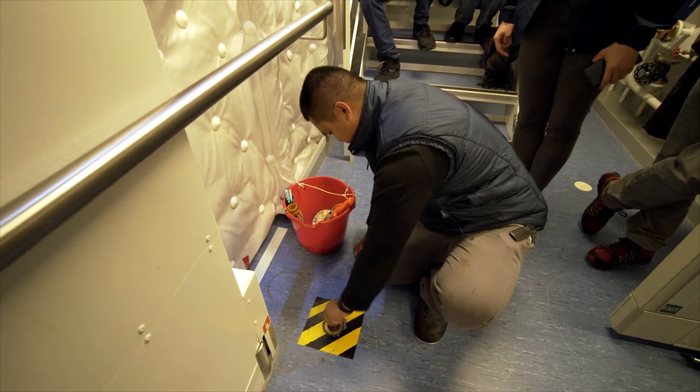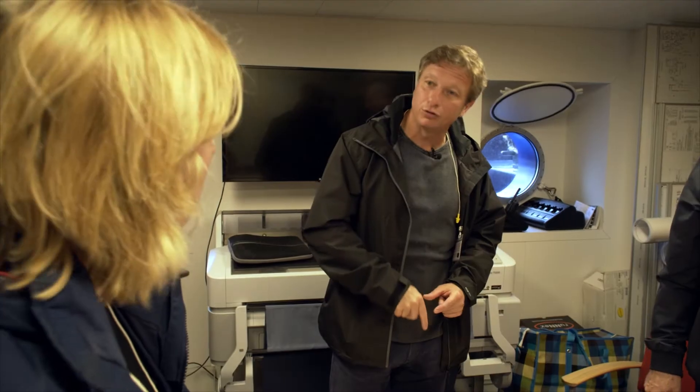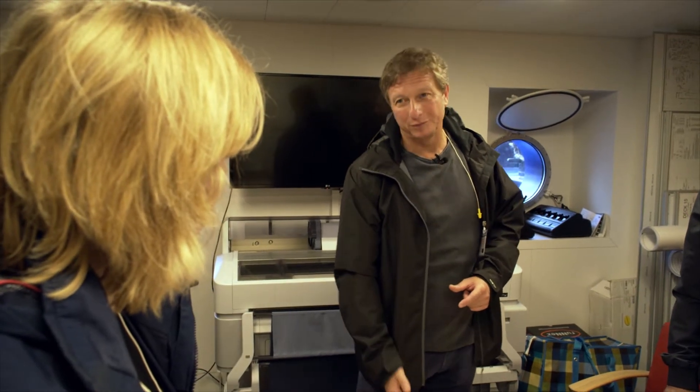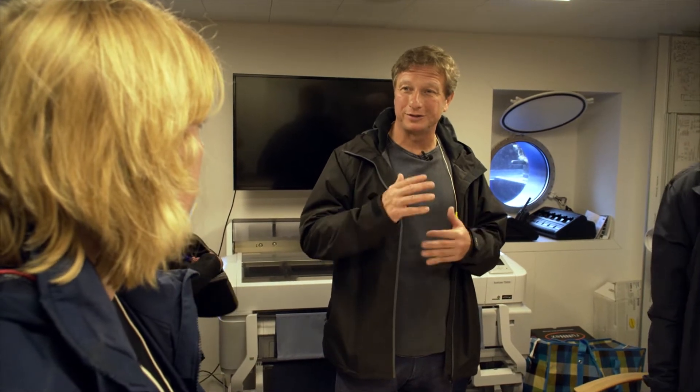If it's higher, let's say five or six meters, then you need to understand how much you need to go down, because we want to take it from the top, from the middle, and then from the bottom. We take it from three different depths because there may be salinity stratification, organism stratification, and these things — that's why we need to take it from different depths.